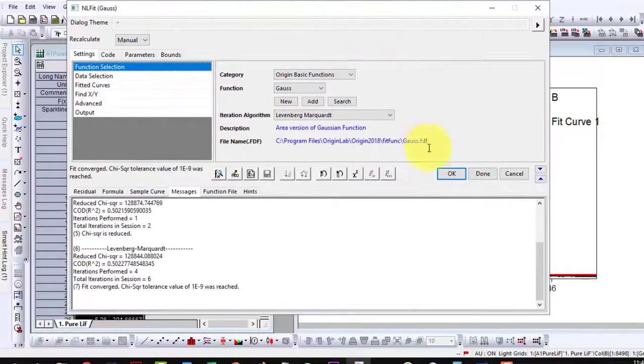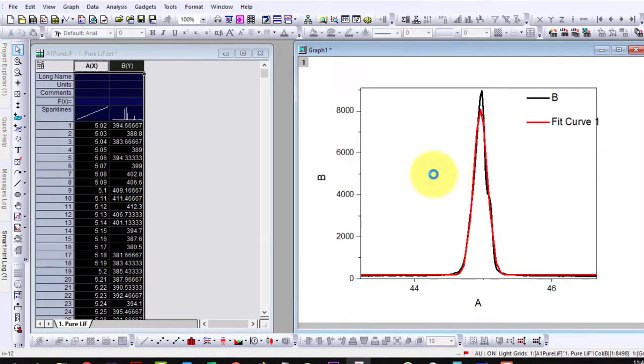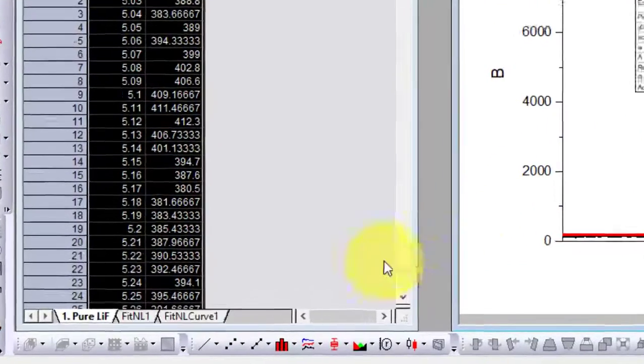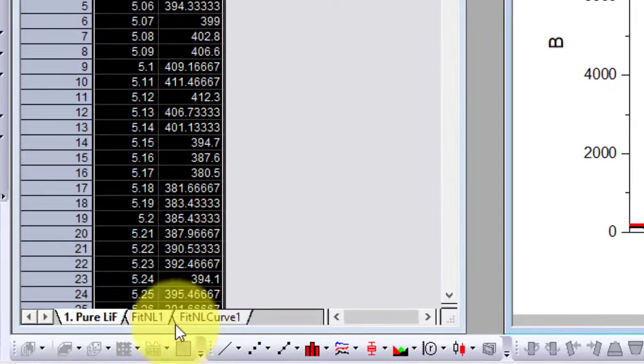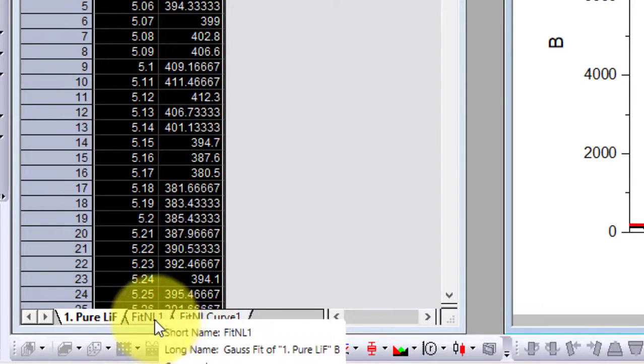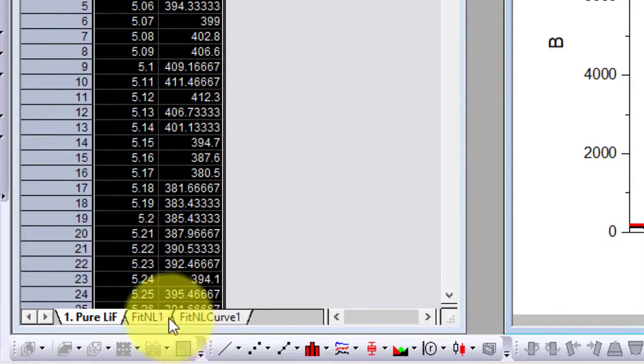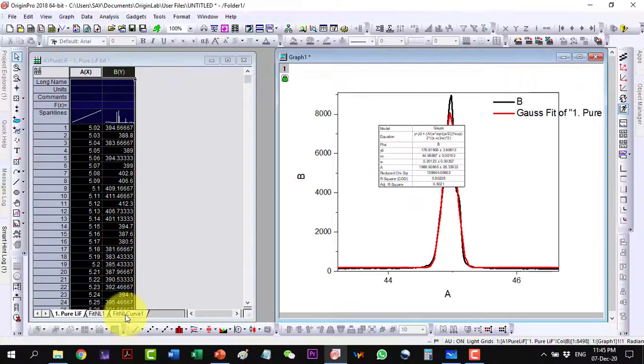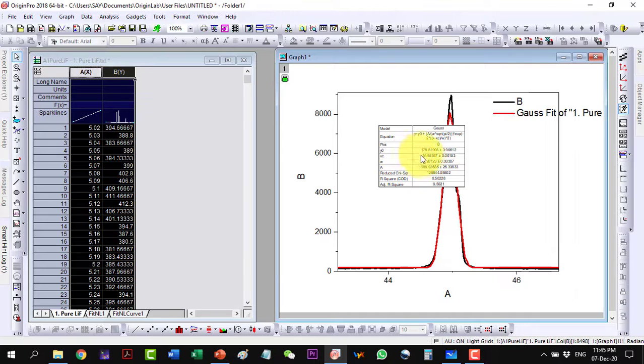Now I will press OK and as I see that it has generated two data sheets here and one over here.